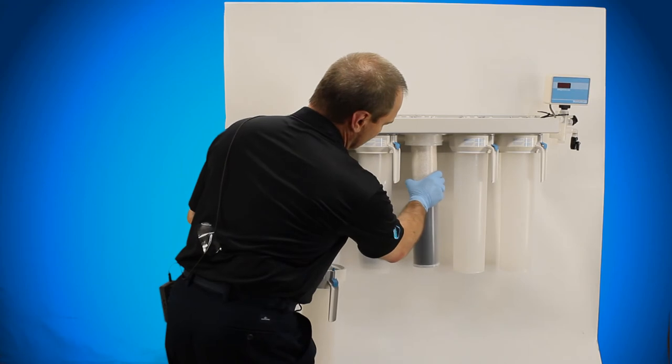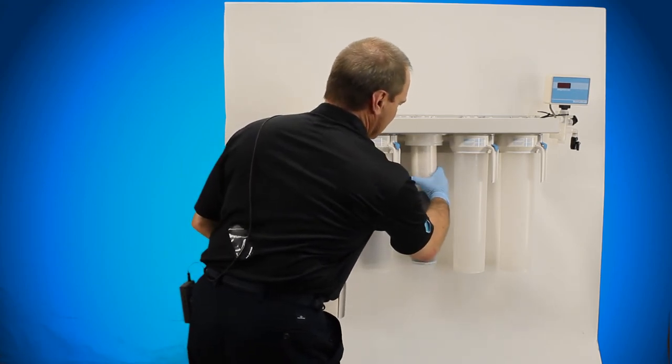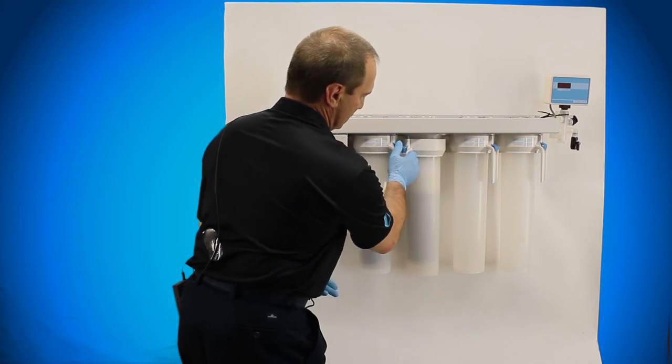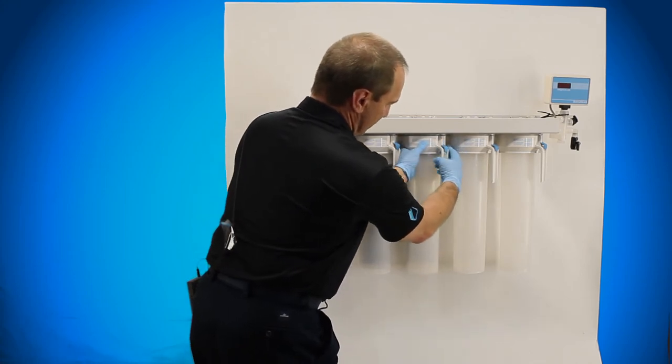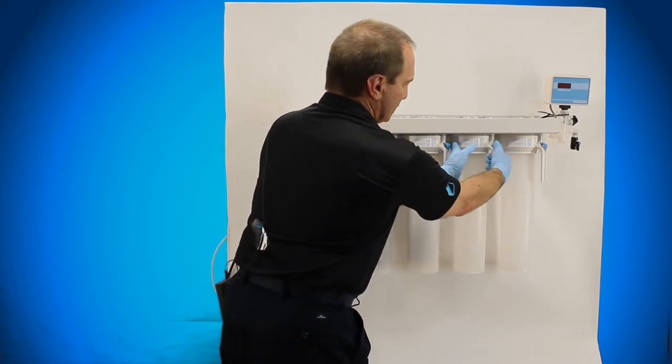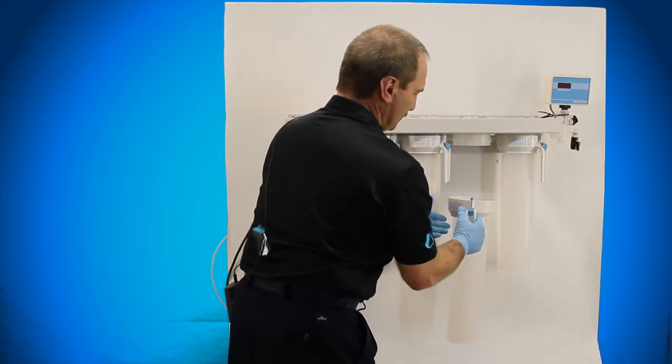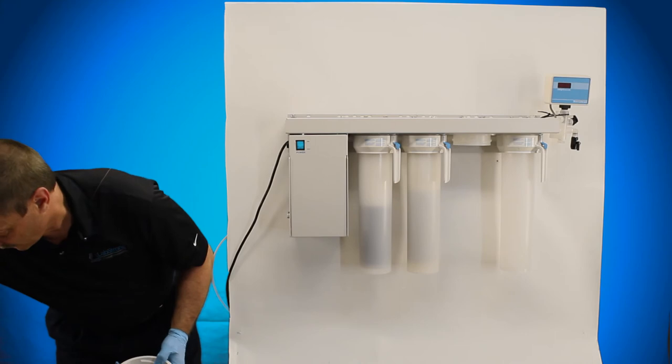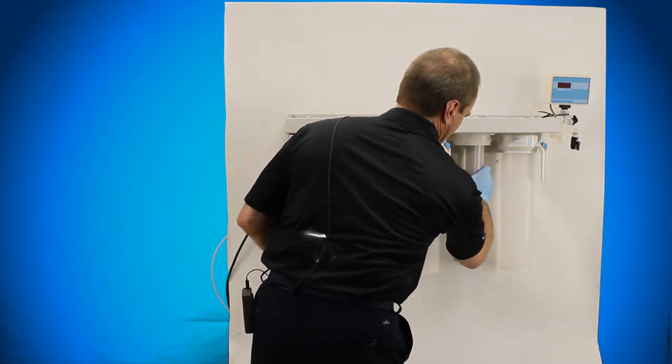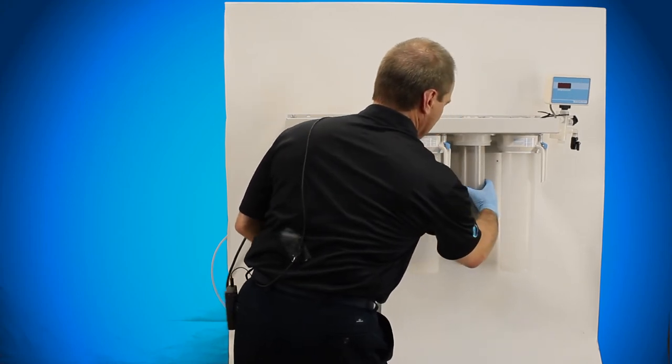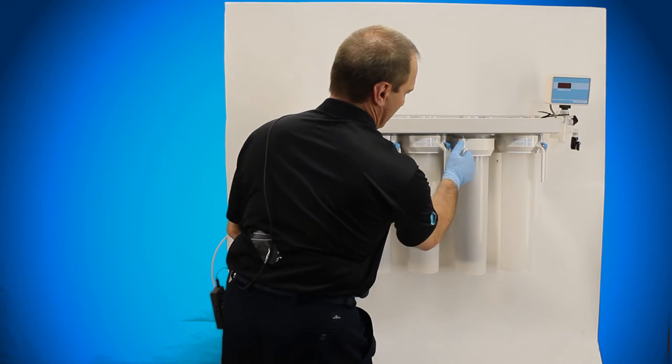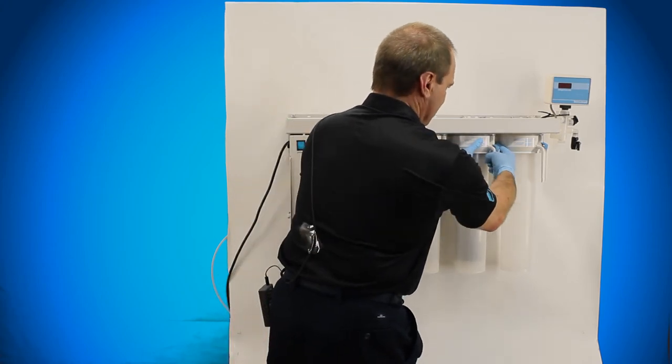So your next cartridge will go up in place, twist it up in place, make sure it locks up there. Take your canister, lock it into place, three clicks, and do that with your third one. Checking to make sure that you have the right cartridge by looking at the stamp on the top. Twist it up into place, quarter turn locking canister, locks in place.